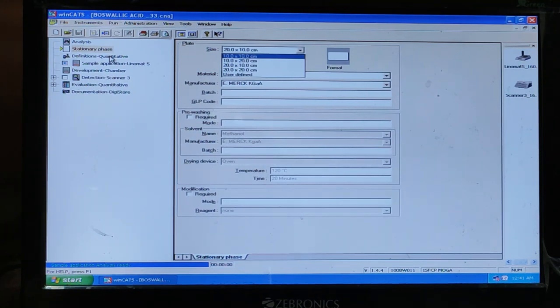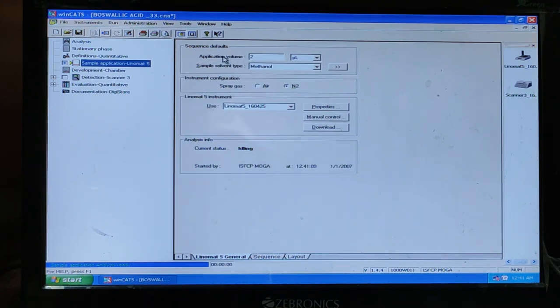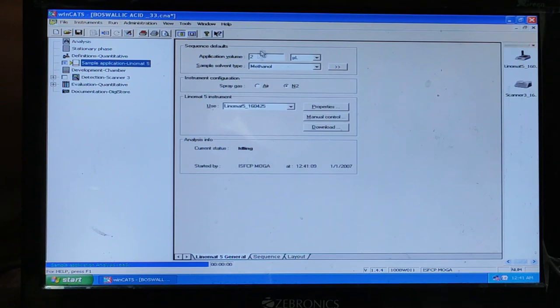Next is, you can select the application volume. How much volume you need. You can also select the sample solvent type in this section.